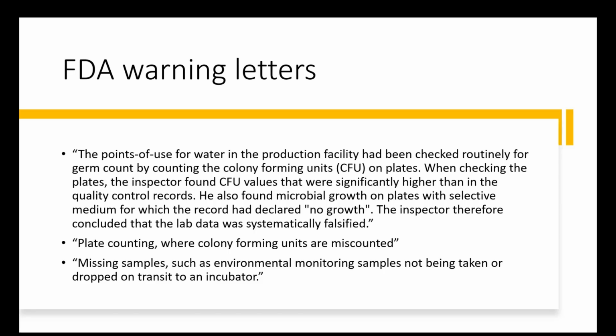There are also some other examples where CFU are miscounted or there are missing samples, or samples that have been dropped and then written off because, oh yes, I know there were so many colonies on the plate, but the lid was locked or something. So it always raises suspicion in the minds of regulators, and it's not unknown for inspectors sometimes to recount plates or even to take plates out of waste bins and re-examine them. And that isn't an urban myth. That's something I've actually seen happen myself.